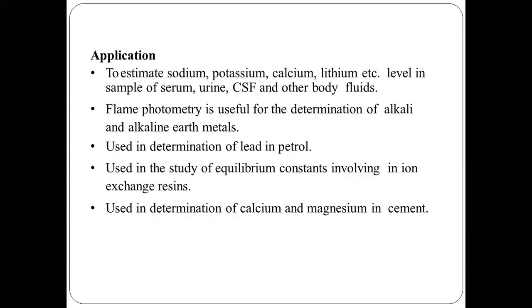And at last, what are the applications of the flame photometer? That means, what are the uses of the flame photometer in our daily routine, or in practical life? First, it is used to estimate sodium, potassium, calcium, lithium, etc. levels in samples of serum, urine, CSF, and other body fluids. When we want to test our urine, serum, CSF, and other body fluids, we use the flame photometer to estimate the content of sodium, potassium, calcium, and lithium.